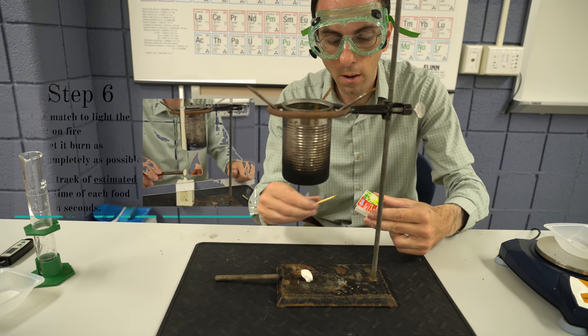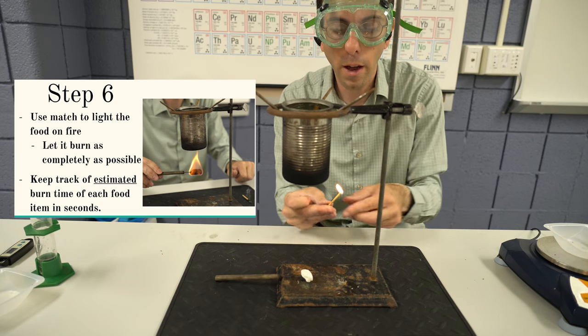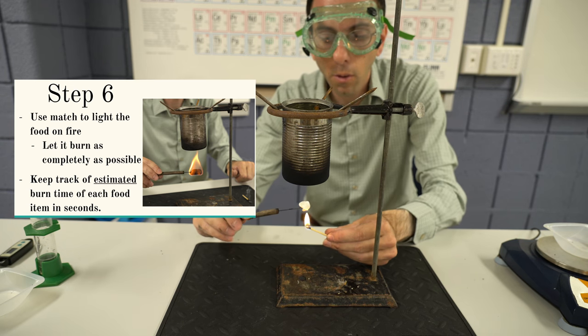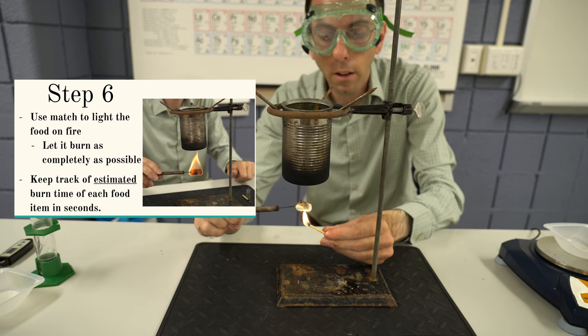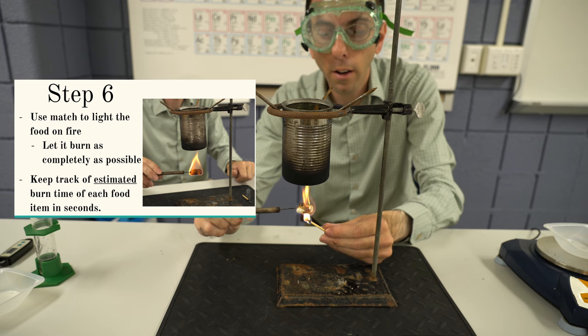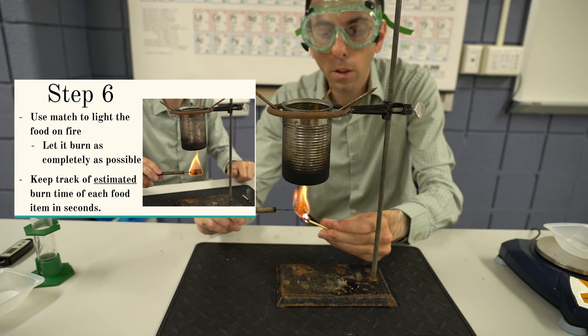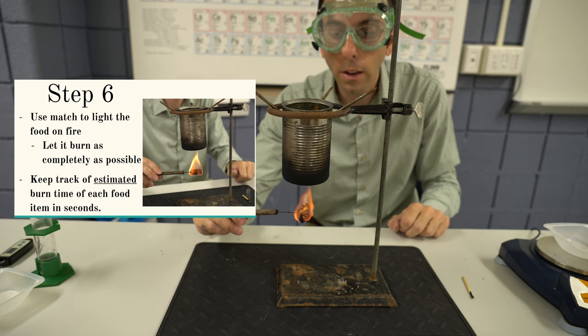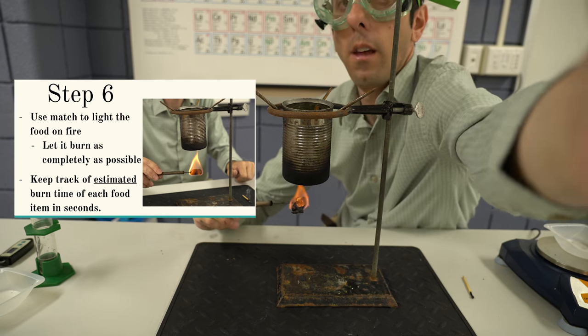So we take our match, we light our match, and remember the hottest part of the flame is kind of towards the top. So we want to be using that to help get our marshmallow here to catch on fire. And we kind of want to rotate it through, blow that out, keeping our food item lit. And you can see right here that nice burn that we're getting.